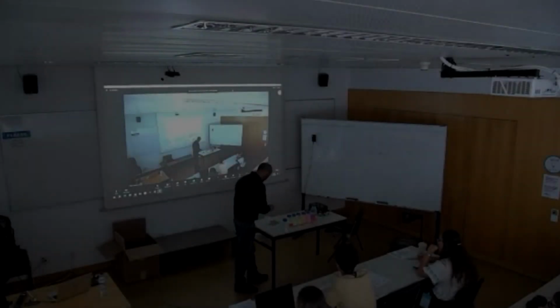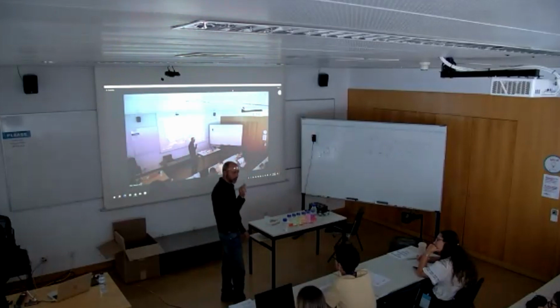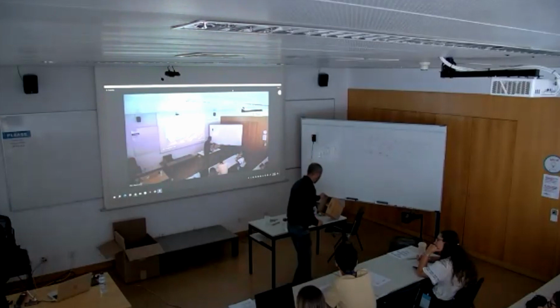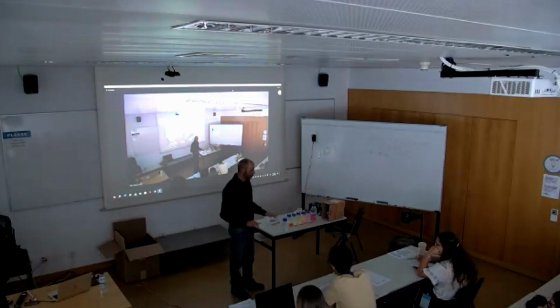And I wanted to show you this demo very quickly. So this is water, and this is a 405 laser, which is at the edge of our visibility capabilities. So it's a UV laser, and when we shine it, I will put a screen here to avoid that people get blinded, so that no accident happens. So this will collect the light. This is plain water. And if I shine the laser here, we don't see anything because the laser is invisible. So far, so good.